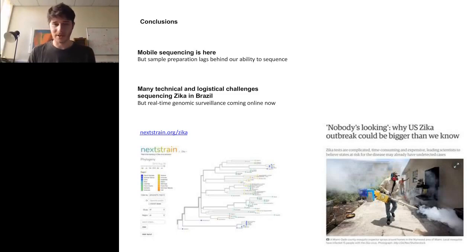develop something which is going to be widely used, it needs to be cost effective, and especially if we're going to be using it in the developing world, where the cost of these things is extremely important. I think the MinION itself is a big step forward in that respect, because the device itself has a very low value, and you're only paying for the consumables, as opposed to having to pay for the instrument as well.